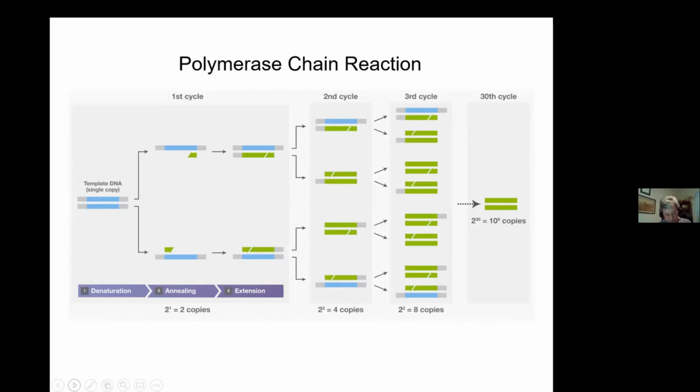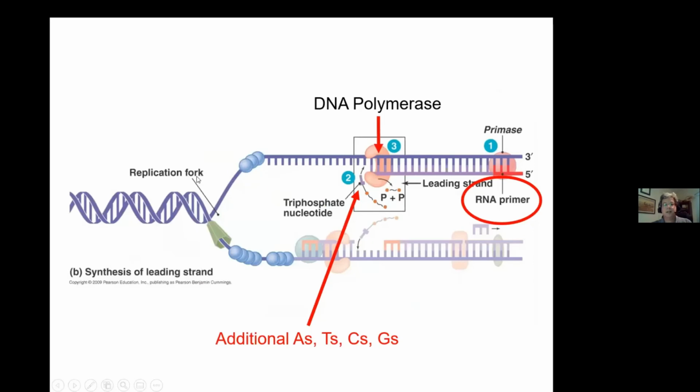All right, so all PCR is doing is using DNA polymerase to take one double helix of DNA and turn it into a billion copies. But there's a couple problems or a couple challenges. So the first is you have to get the two strands apart if you're going to make a copy. And there's several ways you can do that. In the original cell, there's an enzyme here that does it.